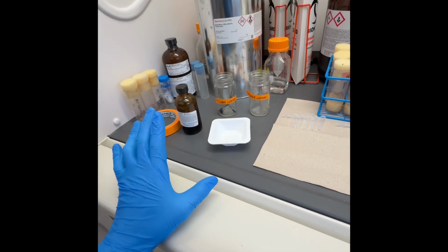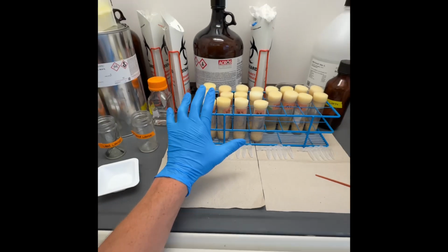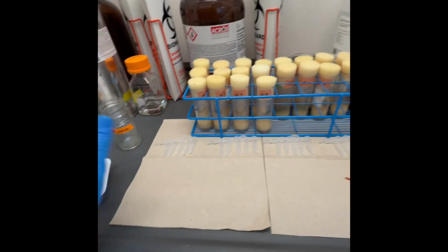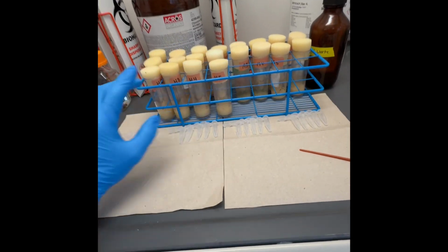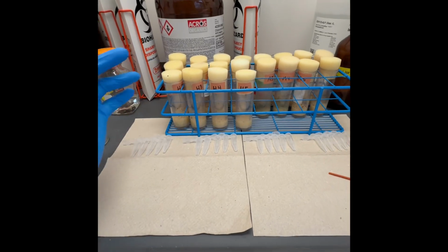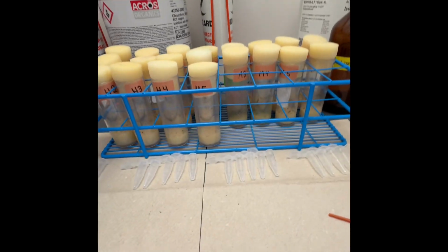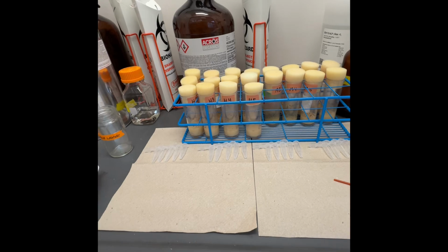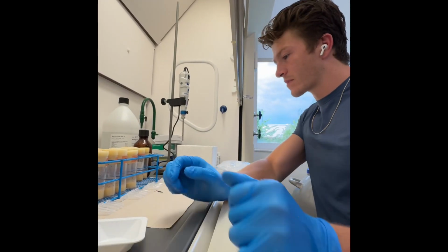So this is what I'm doing right now. I have fed sorbitol in different doses to my flies for 2 weeks. And now it's time for me to put them back to sleep so we can extract their RNA through a process called PCR. And then we're going to be looking at degeneration, seeing if there is degeneration of their cells, etc. So this is pretty interesting.